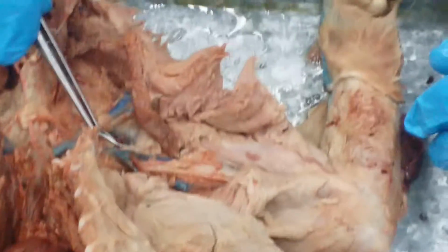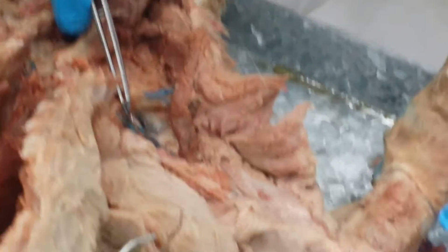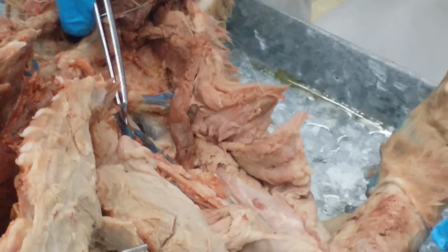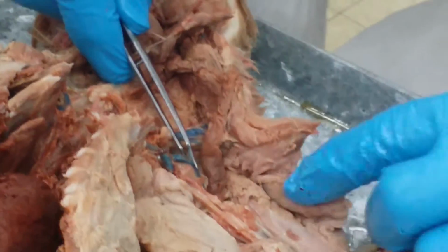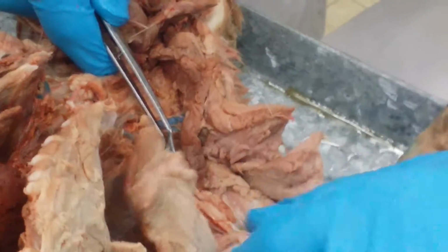The first division is this tiny little piece here. That's called the ventral thoracic. It also is formed from this vessel called the subclavian vein. Goes to the clavicle.